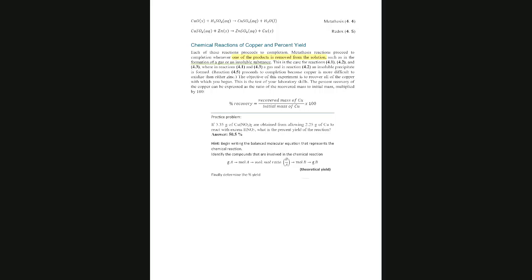Now, let's look at the reaction 4. Can we see why this reaction is a metathesis? The copper, if it's not with oxygen, the only option that it has is the sulfate, right?